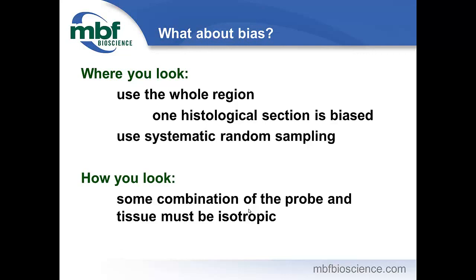Yes, this whole concept of isotropy that we talked about. Look through the webinar and look at those summary slides. Those are going to be your take-home messages for when you're trying to estimate number or length or surface or volume. That's going to let you know how you're going to assure isotropy and whether you can use a thick or a thin section. Yep.